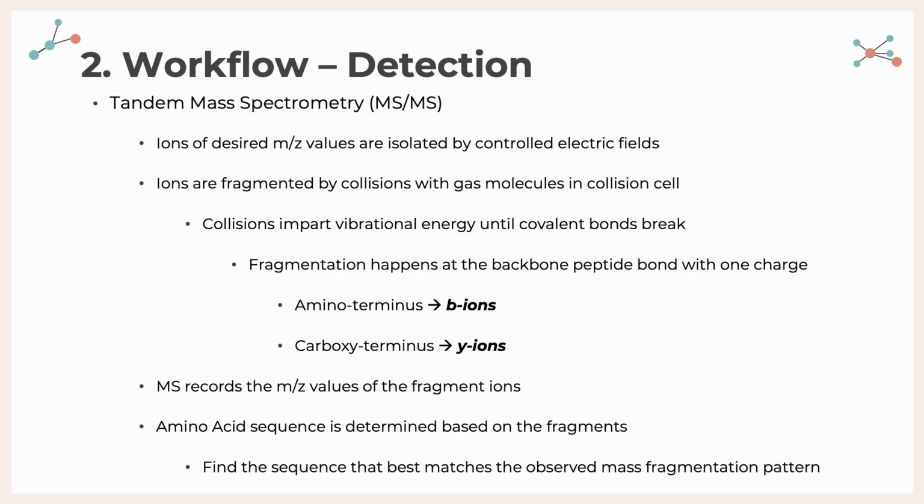One thing to note for this last point regarding the amino acid sequence, keep in mind that isoleucine and leucine are constitutional isomers. So when you're putting together the sequence, you might have isoleucine or leucine, because they are the same mass and they give off the same mass spectrum. That's just one thing to note.